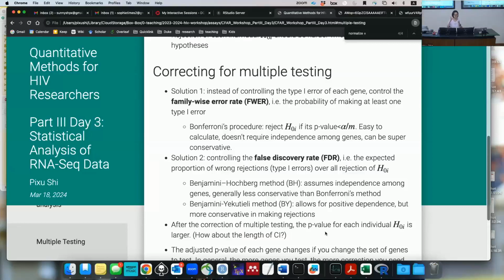So it can be one is more positively expressed, the other is more negatively expressed. So they tend to be more significant together. So it's like looking at families of genes that typically... Yeah, because you're adjusting the p-value. The p-value doesn't have a direction of the effect. Yeah.